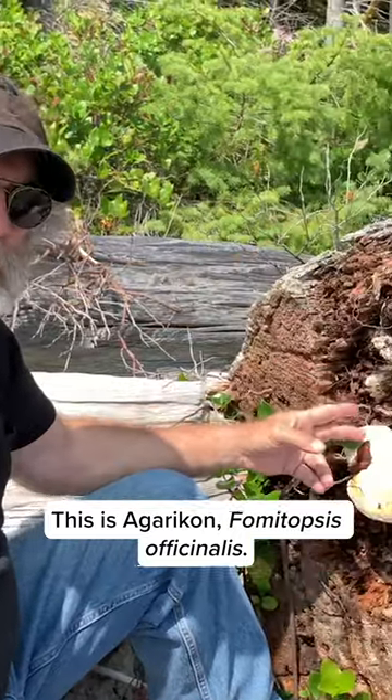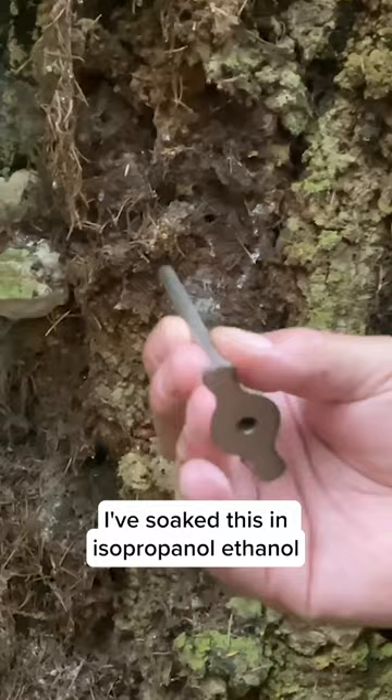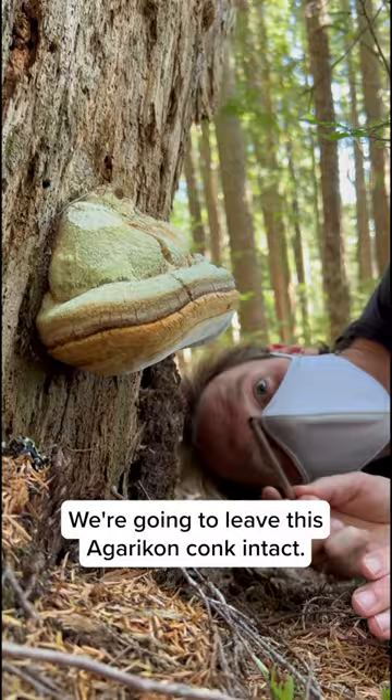This is Agarikon, Fomitopsis officinalis. This is a cork borer. I've soaked this in isopropanol ethanol. I'm going to go underneath here and get a small piece of tissue. I want to do minimum harm to this — we're going to leave this Agarikon conk intact.